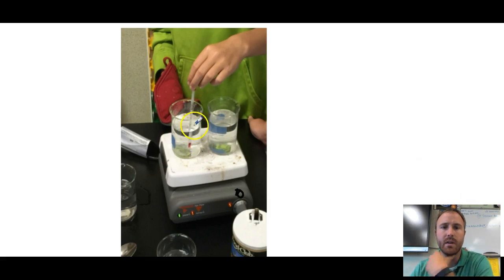You had a thermometer, and we talked about you don't want to put the thermometer all the way down at the bottom of the beaker. The main reason why is because this hot plate is giving off heat, and we don't want to register what the temperature of this is, but rather what the water is. So my suggestion was that you put it down, touch the bottom, come off maybe a couple of centimeters, and then also there is steam that's being released here. You want to make sure that you tilt the thermometer because you want to try not to get as much of the direct steam on there where it can actually burn your hand.